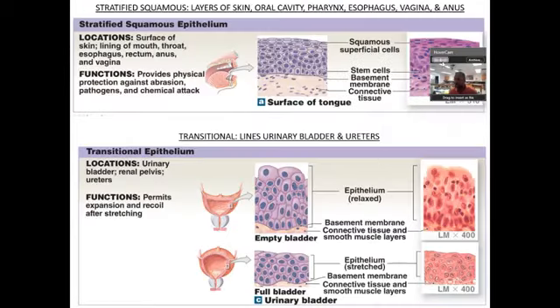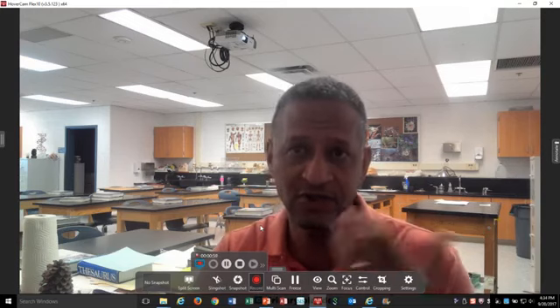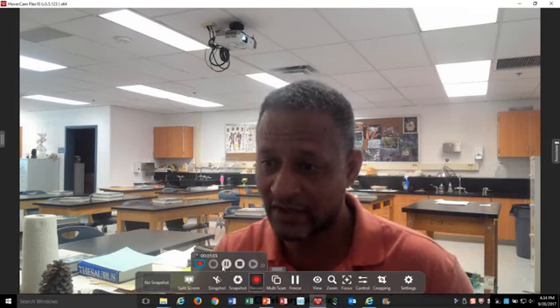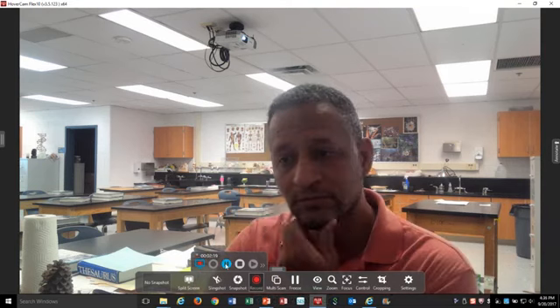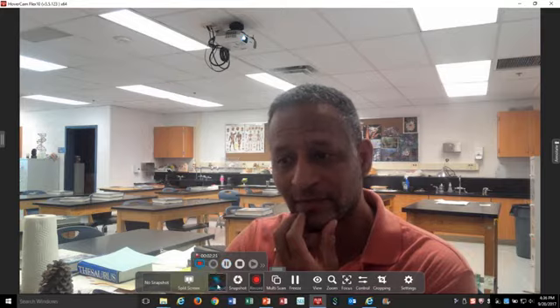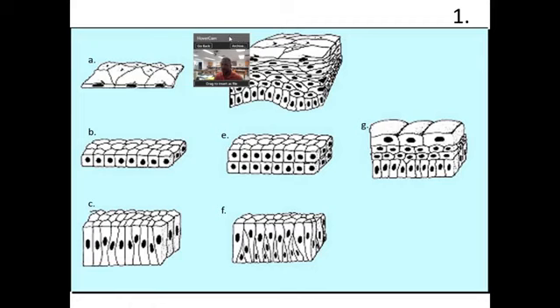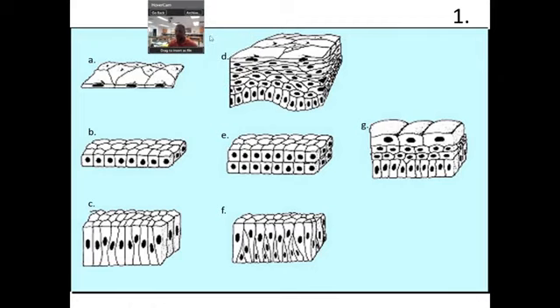So what I want to do now is switch slides and do some practice. I'm going to show a slide and then show the answer, show the slide and then show the answer. And I'll probably do a speed round at the end. All right, let's begin. So here are the slides. If you're one of my students, what I recommend is finding the PowerPoint that's on Blackboard and going through and doing this for yourself.